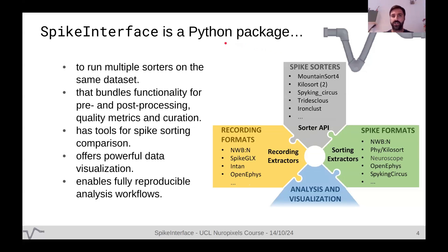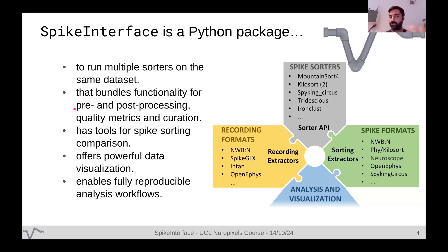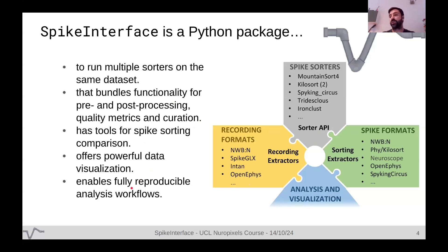SpikeInterface is a mature Python package that allows you to run multiple spike sorters on the same dataset really easily. On top of this, we built many additional functionalities: tools that Olivier presented for preprocessing — bandpass filtering, bad channel detection, phase shifts, drift correction. We also have tools after spike sorting to compute additional data, quality metrics, automatic curation, comparison of multiple spike sorters, and powerful data visualization — all done as reproducibly as possible.